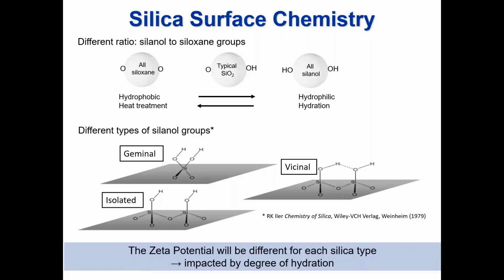A simple experiment: take a silica powder, heat it in an oven, let it cool, put it in water, measure the Zeta potential. Then measure it after 24 hours. It can often take more than 24 hours to attain a true equilibrium and a constant zeta potential. This needs to be checked for any silicas.